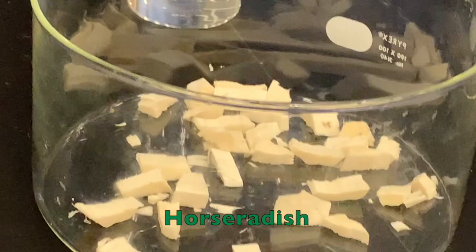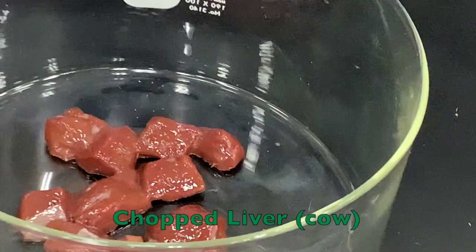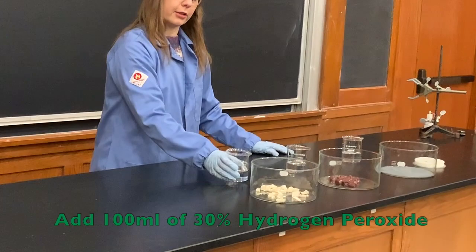This first dish contains horseradish, the second dish contains chopped liver, and finally we have manganese dioxide. I'm going to pour 100 milliliters of 30% hydrogen peroxide in each dish so we can observe the catalytic decomposition.